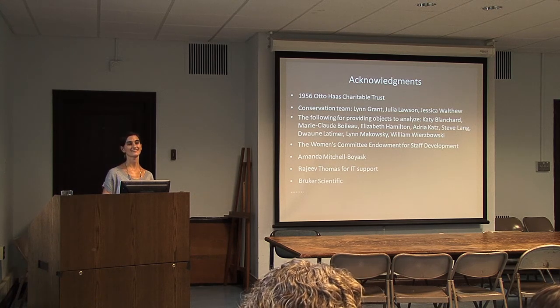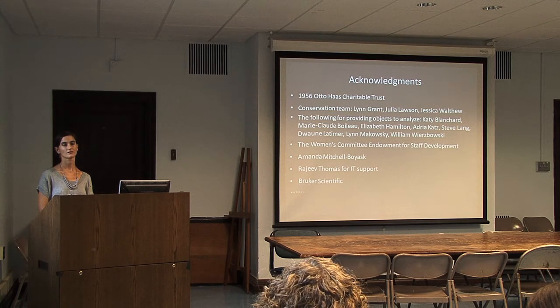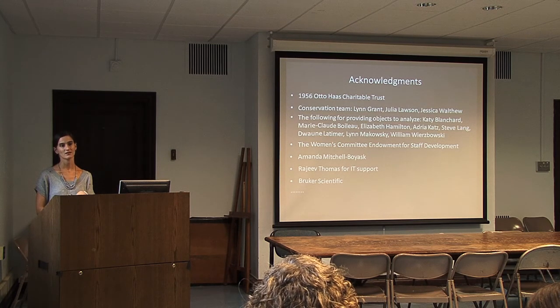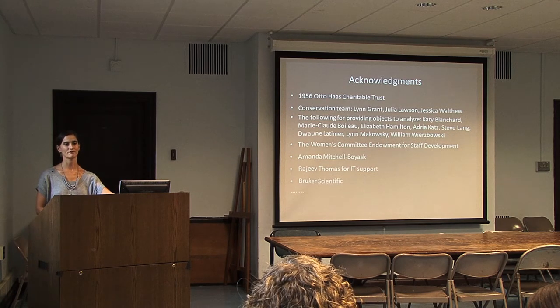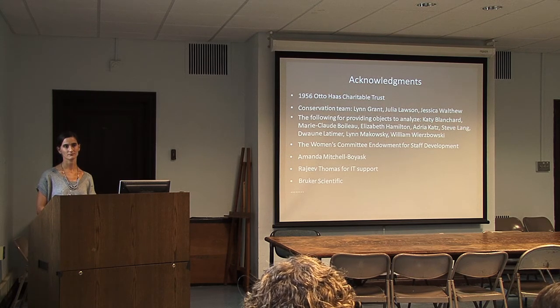Yes. In the case of chromium, you showed that you're presuming that it appears mostly as the chromate anion, but I'm wondering what kind of follow-up methods you use to elucidate whether you have cationic chromium, or chromate, or dichromate? So that would be a structural question, and XRF can't answer that. What I'm assuming is that chromium in some form or another is present. If I wanted to know what shape that chromium takes, I would probably take a small sample and use X-ray diffraction to get the crystal structure information. That would be the next step that I would think to do. But I'm not assuming what form the chromium is here. It's just that I know that lead chromate is a common yellow pigment. That's the assumption.